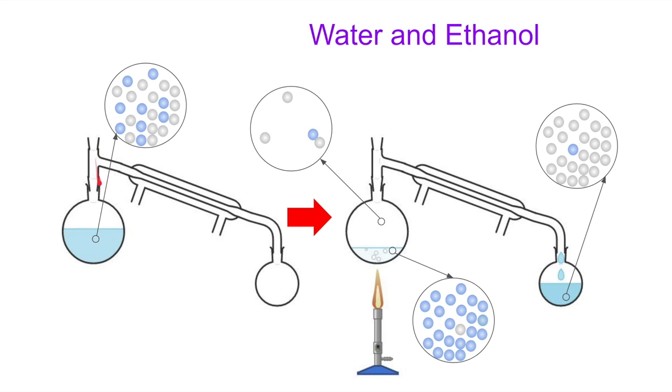So this will be sealed up, and then the vapor, the gas that's created as this undergoes phase changes and begins to boil, has no place to go but here. And then it starts to progress down this tube as well. Now this tube goes inside of another tube that wraps around it. And this other tube has two openings, an inlet and an outlet.